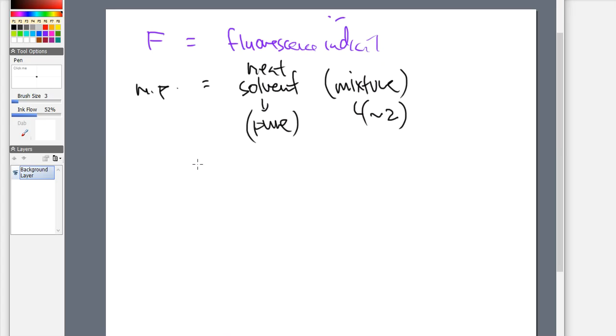And we can talk about what we call solvent strength. All right. So solvent strength is the idea that things begin to separate for us. And as things begin to separate onto the plate, well, we can control that separation by making the solvent stronger or weaker, I guess is how you can refer to that. Now, there's another term here that we're getting ready to talk about.